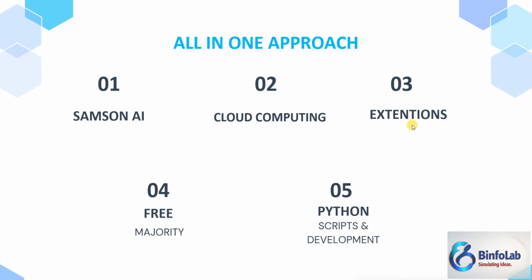Another important thing, SAMSON is using the extension way. Just like nowadays, if you are an iPhone user, you see an app store specified for iPhone, and likewise for Samsung and other mobiles. In a similar way, SAMSON has its own app store, and the app store contains a lot of seriously good extensions. I will give you a visit in today's video and you will see, wow. Just from one click, you can import that extension into your SAMSON and perform your analysis.